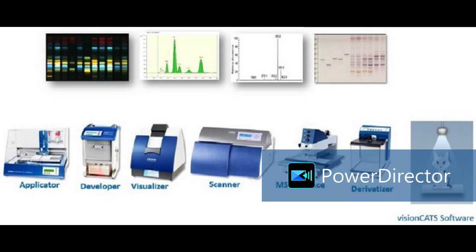This is the principle of the scanner. 3 lamps: deuterium, tungsten, mercury. From that, polychromatic light will be generated, and the monochromator will generate monochromatic light out of polychromatic. What is monochromatic? It is nothing but, in a simple way, we can consider it as single wavelength light. Okay, so when the white light lamp is turned on, it will generate 400 nanometer to 900, all wavelengths.